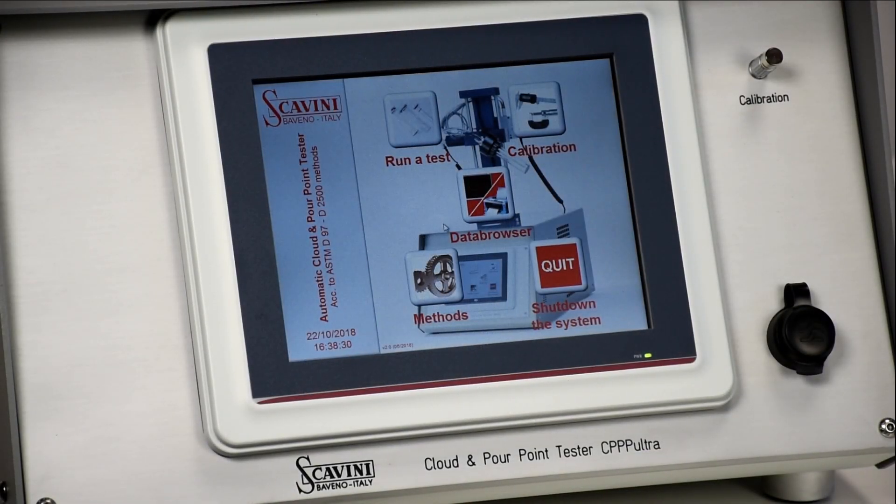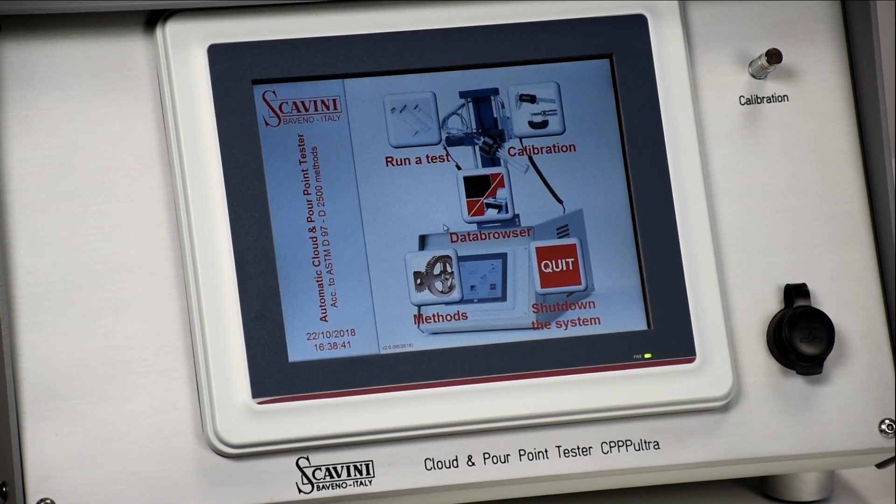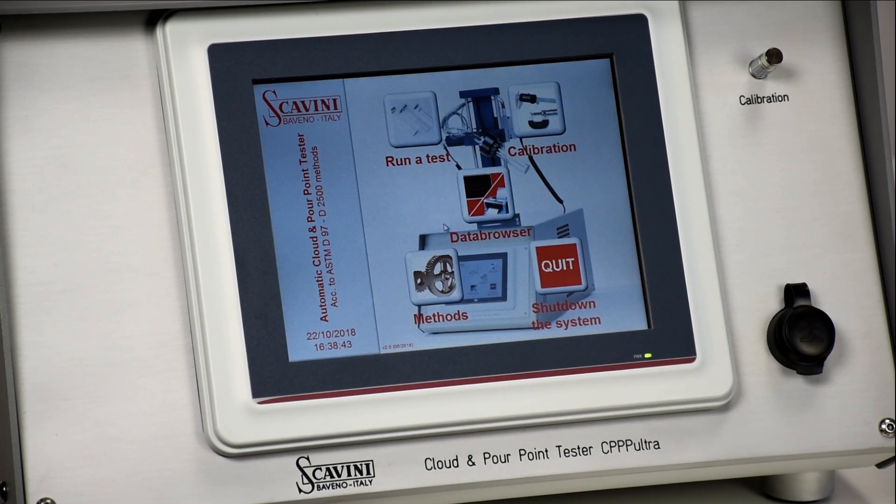The graphic user-friendly software allows the user to enter sample and test data, perform tests according to standard and user-defined methods, save and retrieve test reports. It also permits running diagnostic and calibration routines.